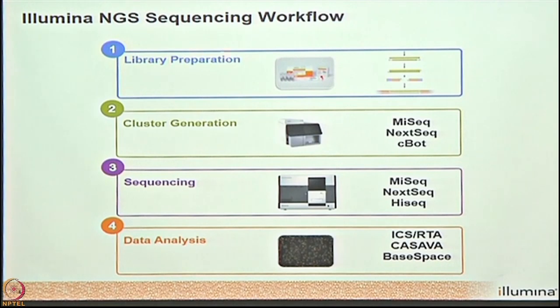The very first step involved in all the sequencers is library preparation, which is followed by cluster generation. Then comes the sequencing, and final is the data analysis part. So first is the library preparation. It's common for all the platforms. Though the sequencers are different, the concept remains the same.